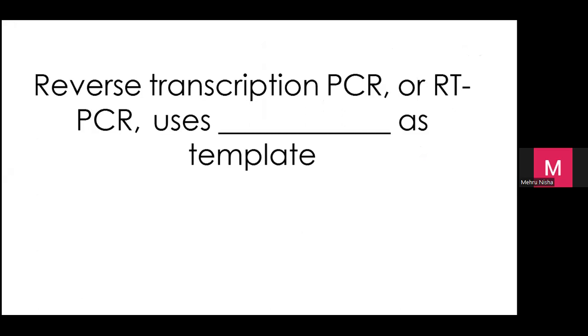Thank you very much. Okay, glad you all are understanding. So the only difference, kalau single PCR guna apa? Single PCR guna DNA as template. Reverse transcriptase use mRNA as template. Template which actually you tukar balik pada cDNA. That's the difference.